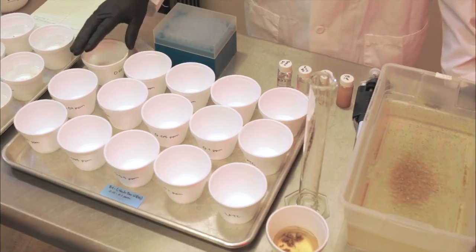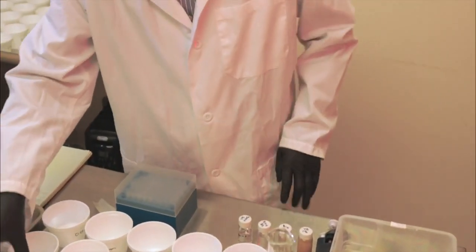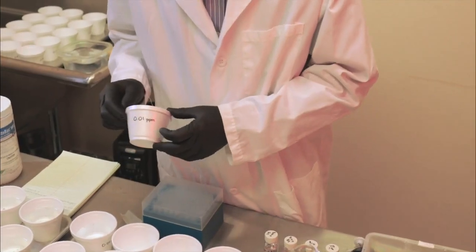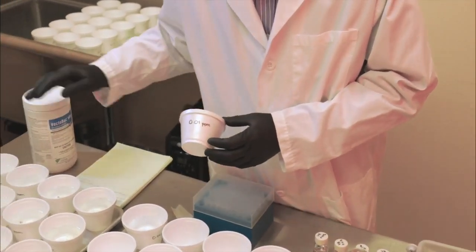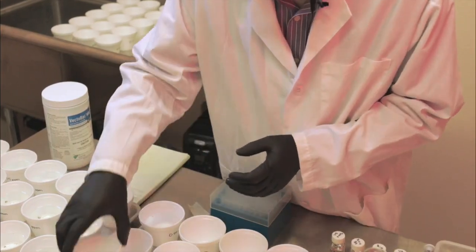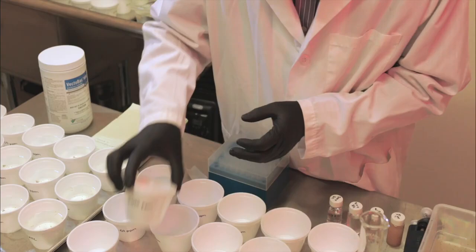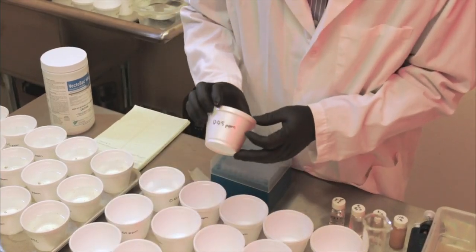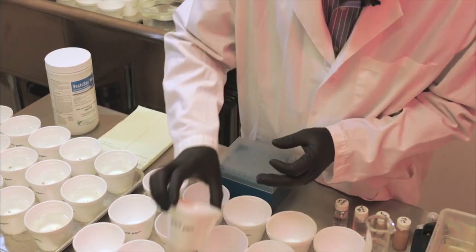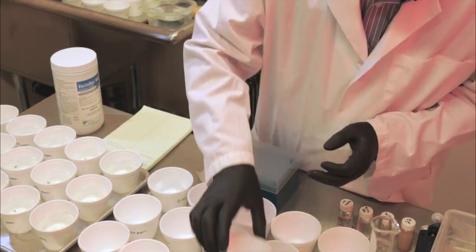So after I've done all the water and the larvae, you make a treatment. The range we're using here for BTI, for this material, we use the range of 0.01 parts per million, then 0.025 parts per million, then 0.05 parts per million, and the last one is 0.1 parts per million.